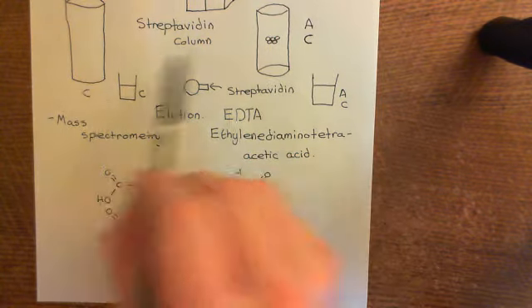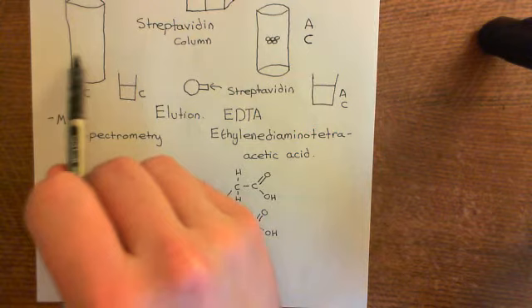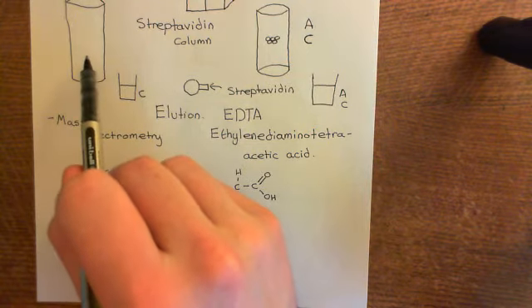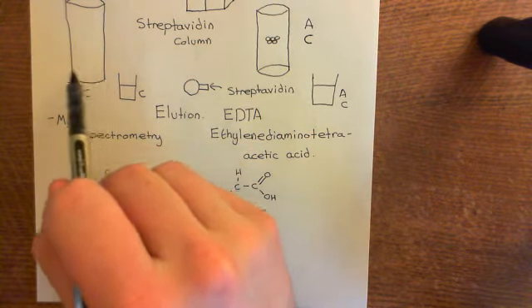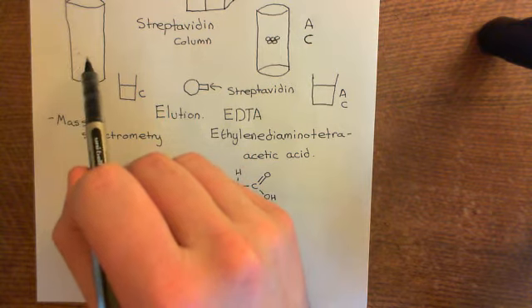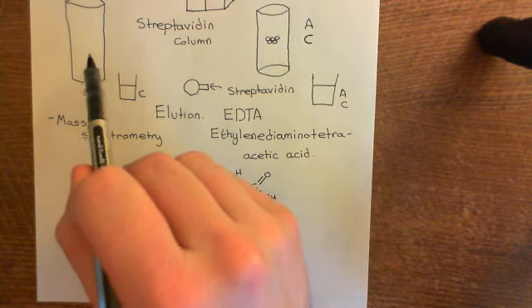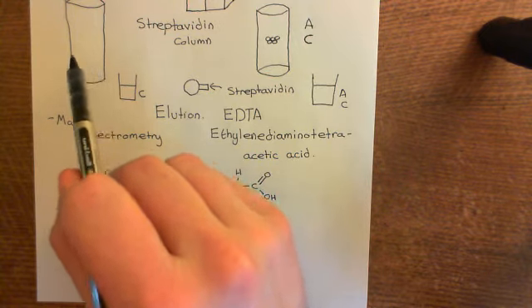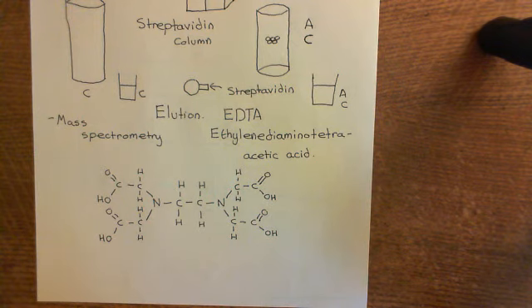The ones which bind in both cases are just binding to the beads anyway, because we know in the control none of these have BMCC bound to them, because none of them have free cysteine residues when you added the BMCC, because we'd already neutralized all of the free cysteine residues with the N-ethylmaleimide, and we hadn't knocked any palmitoyl groups off because we hadn't added hydroxylamine, so the BMCC cannot have bound to the proteins. Okay, so that's the way in which acyl-biotin exchange chemistry can be used to determine which proteins in a sample of proteins have palmitoyl groups stuck on the side of them.